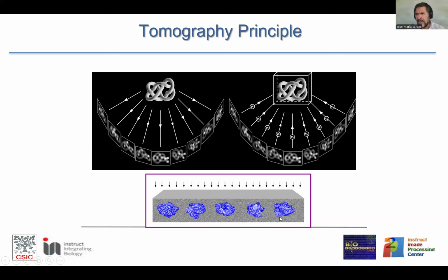But today I will concentrate, thinking that many of you would be coming from other technologies, on the part that is called single particle analysis, when you have a purified specimen and then you want to study the structure of that specimen. Understand something very important: these specimens are free to move, so they have relative orientation, but also we are not constraining them through the forces of a crystal or anything like that.